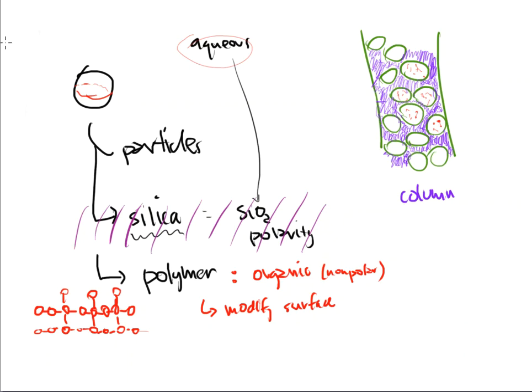So what's the problem with them now? I kind of mentioned it already, but let me give you a few more reasons on why silica is something that you need to stay away from, all right? So number one, what we're going to find out is that silica can be used, but silica cannot be used in suppression. So basically what that means is if I'm running anions, silica is not the way to go.